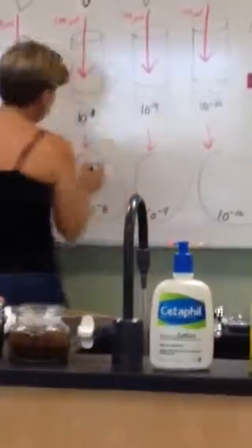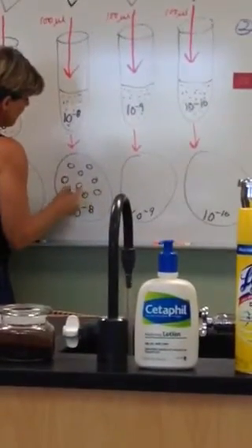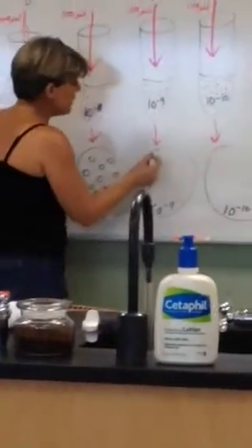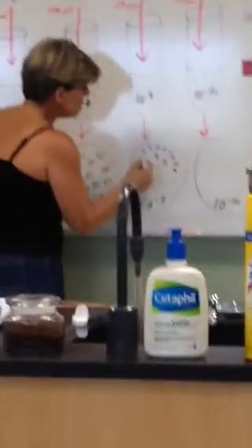Maybe this plate has however many plaques on it. Maybe this plate has many more plaques. They're smaller, but there's a lot more of them.